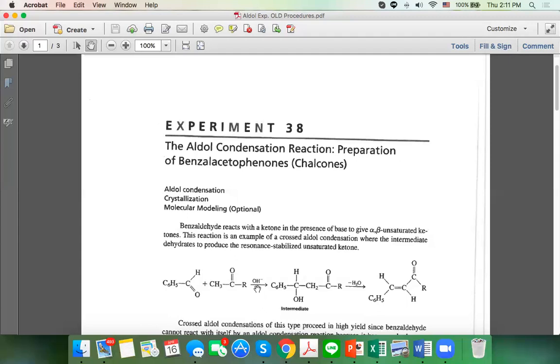And Nathan, you have a question about, okay, Dr. Shunguailato, always label the alpha carbon. Yes, it is a very special carbon, a very special hydrogen. If it is available on the carbon, it will do the magic for you. So one more time, what's important here? Alpha hydrogen is acidic. It will be taken away by the base. You will be adding the base to this reaction mixture, and you are able to create a new carbon-carbon bond. And this is the beauty of aldol condensation.